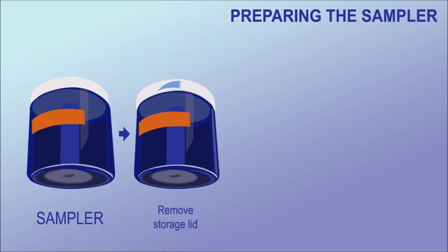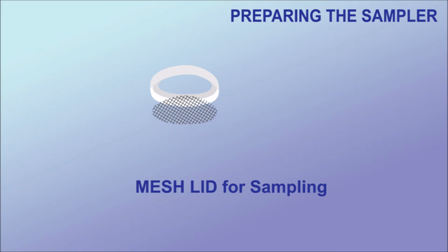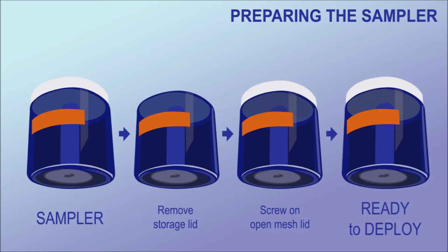First, remove the storage lid. Store caps for the retrieval procedure. A mesh lid for sampling needs to be installed instead. To prepare the mesh lid, hold the mesh concave down and insert it into the lid. The mesh lid can now be screwed on and be tightened. The sampler is now ready to deploy.